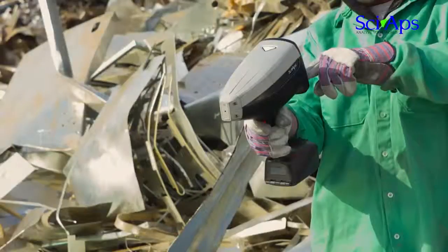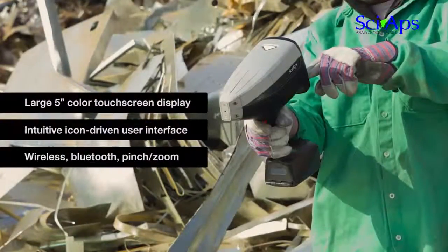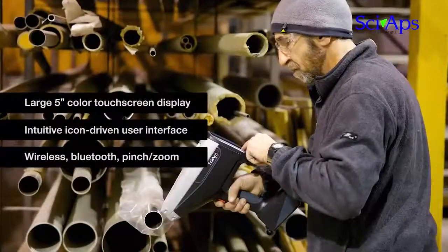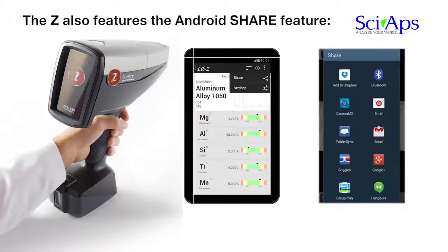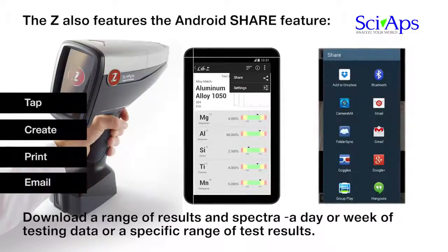The SIAPS-Z features a large 5-inch color touch screen display for easy results viewing and an intuitive icon-driven user interface. Chemistry, test results, pictures, and video are all easily viewed. One tap to the pinch-zoom display lets you look at spectra or specific regions. The Android platform delivers app compatibility, data sharing, and connectivity to other devices unprecedented in portable analyzers. Tap the icon and the analyzer shows any connectable device via Bluetooth or wireless.